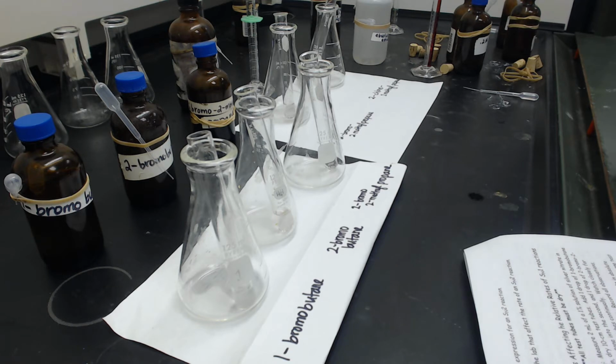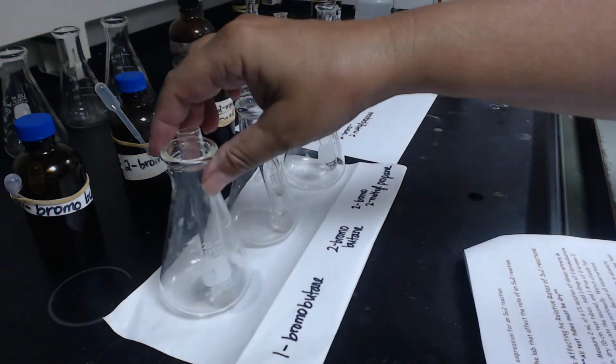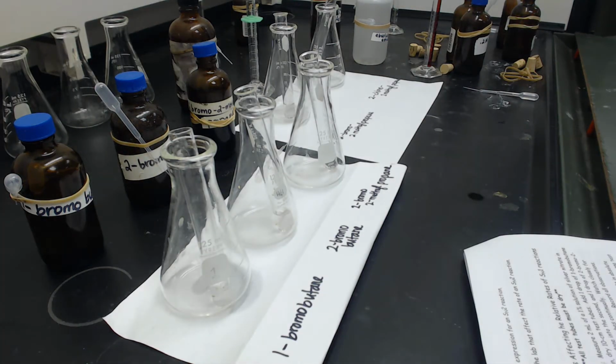So, again, let me try this, see if it's better. It might be too bright with that light on, but I can't tell. I think I'll keep it on. All right, I'll hold the test tubes in front of the camera.